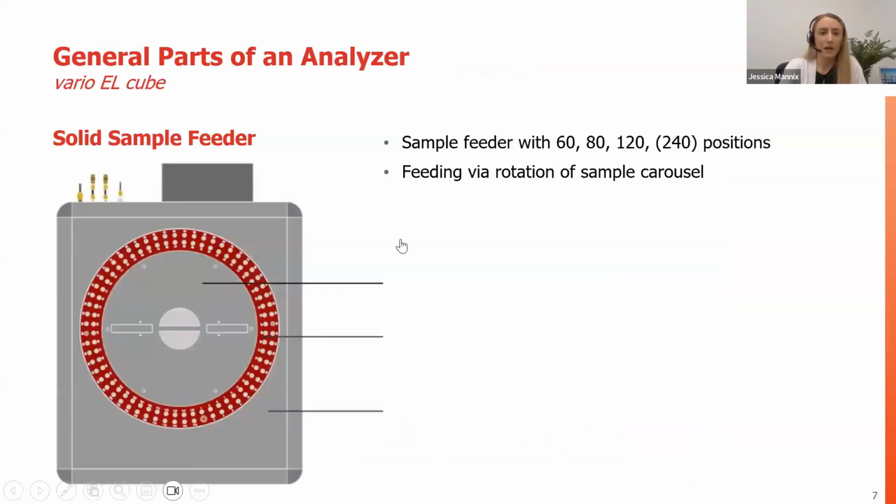Great. And what does this really look like? When we're talking about sample introduction, we need to somehow get the sample into the elemental analyzer, right? So there's a bunch of different ways that we can do this.